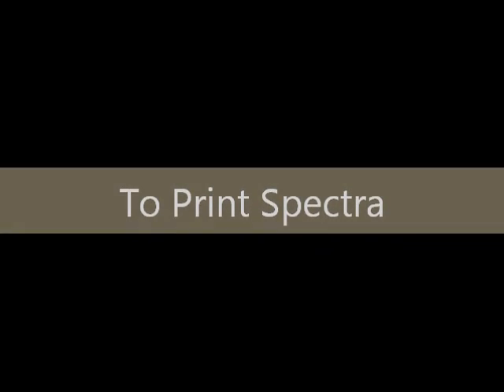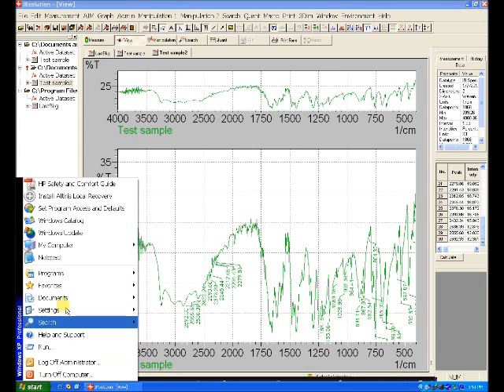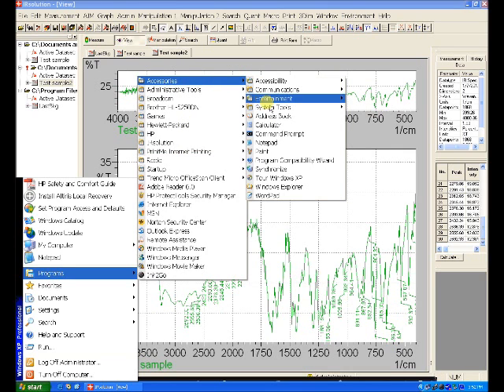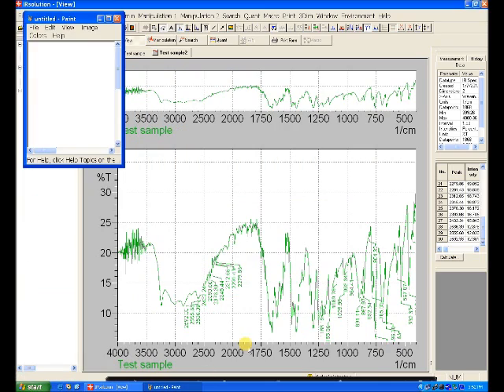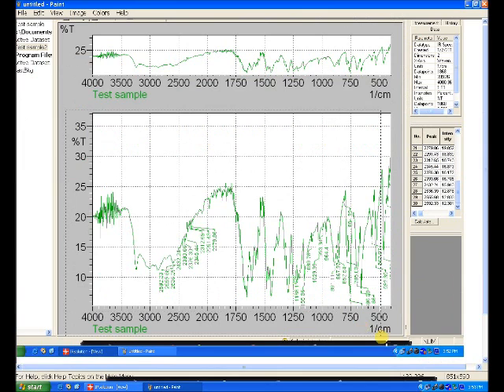What you can do now is to print. You just key in the cursor, print screen, and after that, copy this image into Paint. This is a function in every single Windows program. Go to the desktop, your start bar, go to Programs, Accessories, and Paint. After that, you just have to crop the portion of the spectrum that you want to be shown on the paper you're submitting.